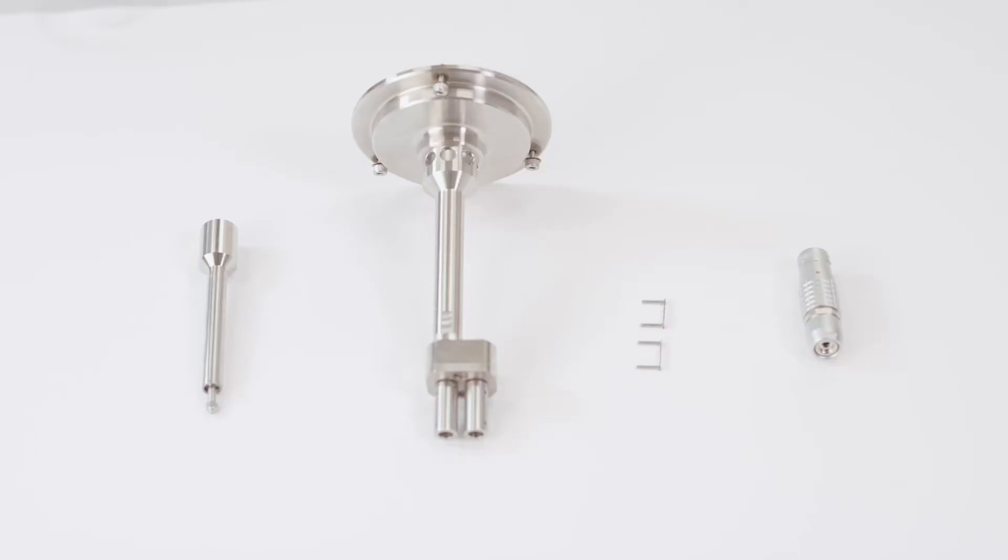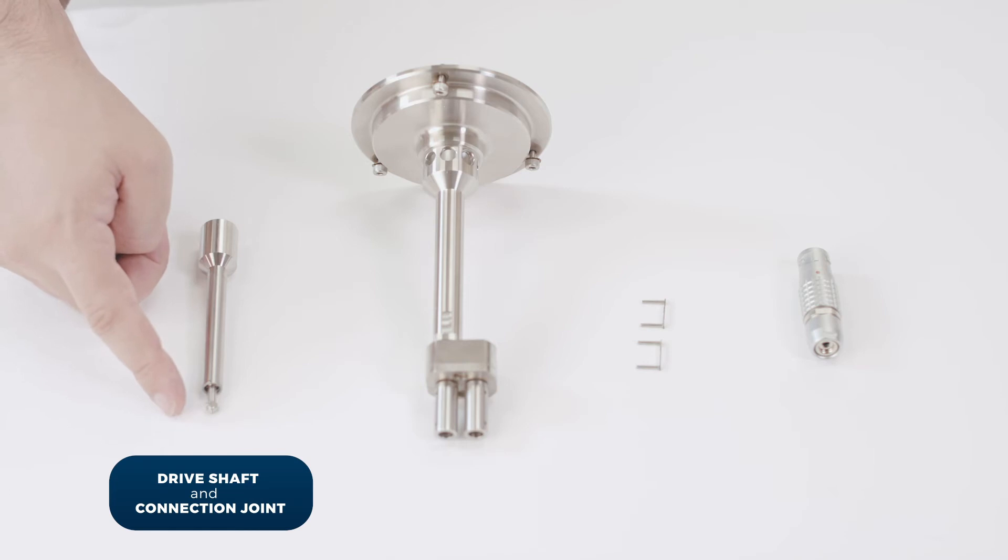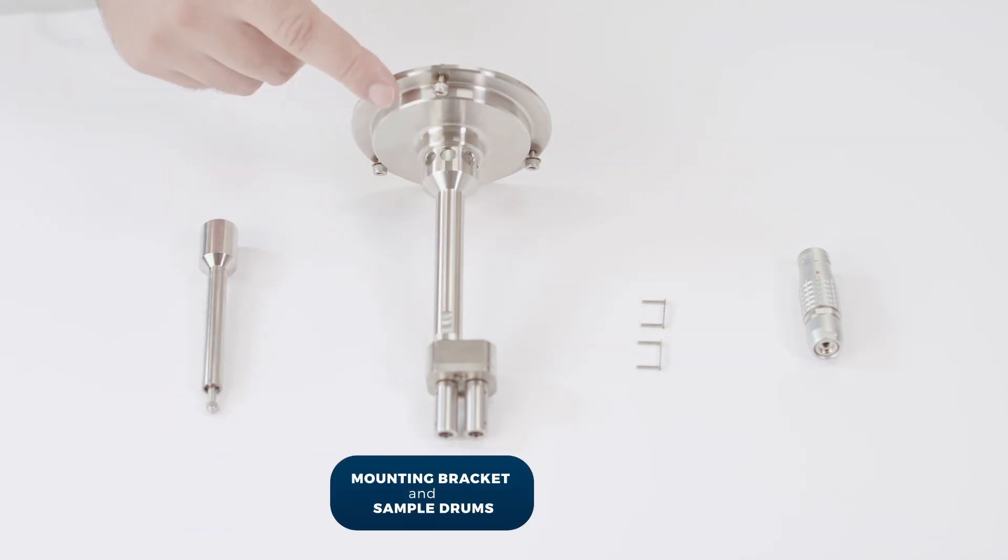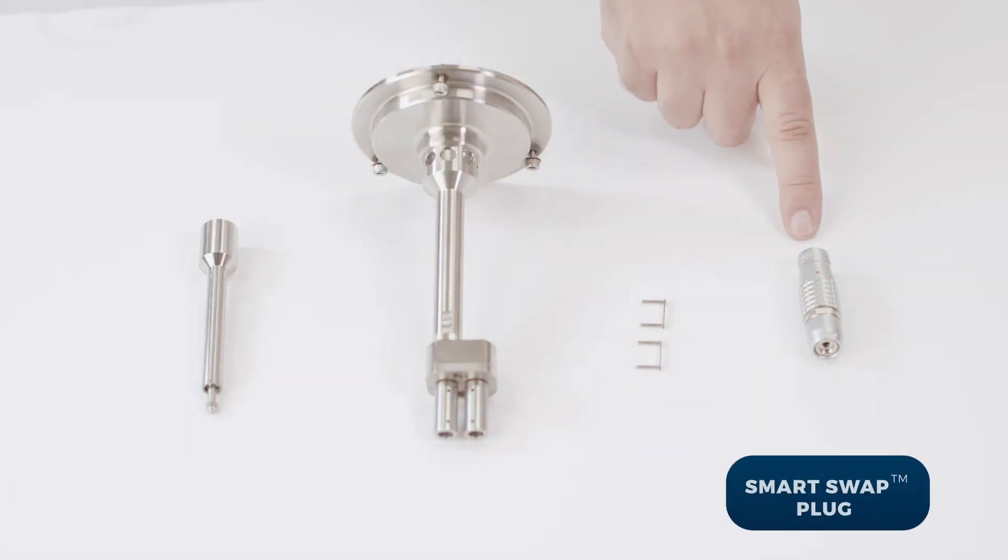These are the parts of the extensional viscosity accessory: the driveshaft and connection joint, mounting bracket, sample drums and clips, and smart swap plug.